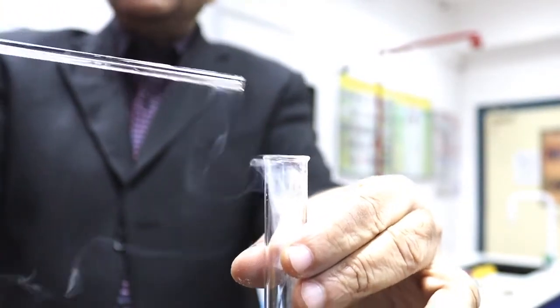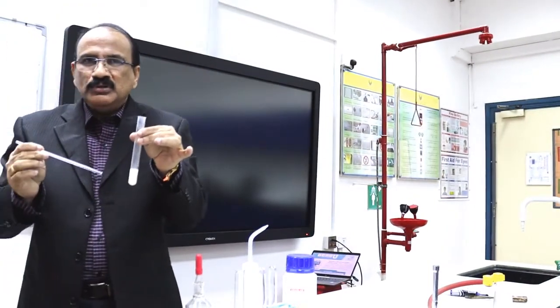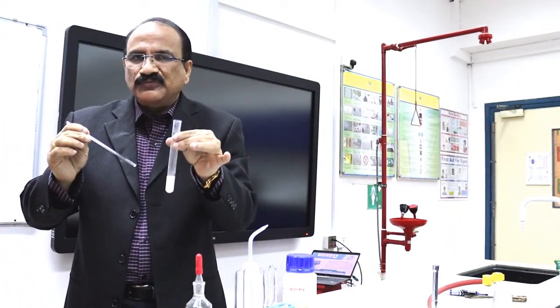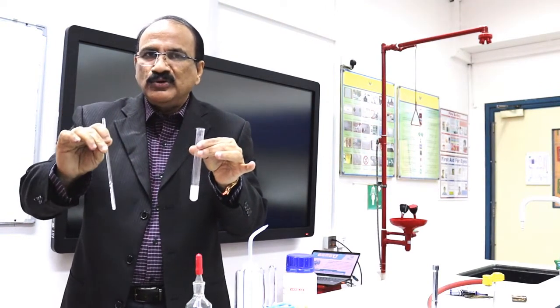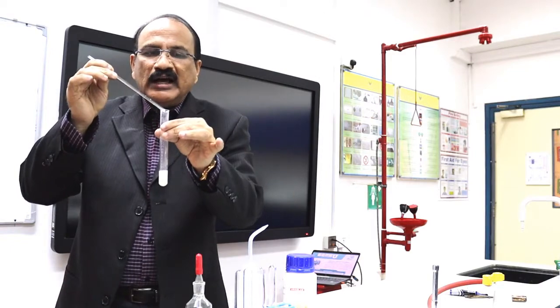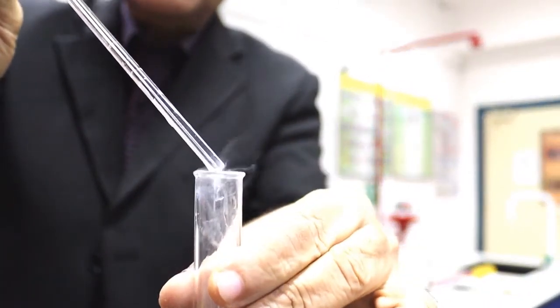This is a preliminary test of chloride ion. Take the salt in a test tube, add concentrated sulfuric acid, take a glass rod, dip it in ammonium hydroxide bottle, introduce at the mouth of the test tube, then you can see white dense fumes.